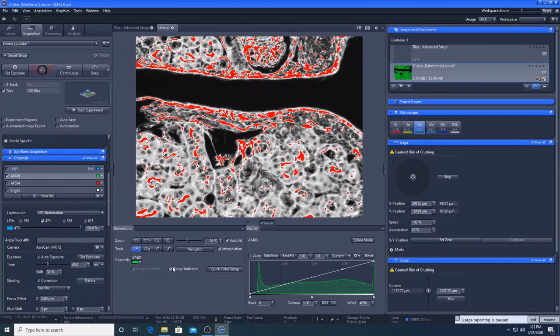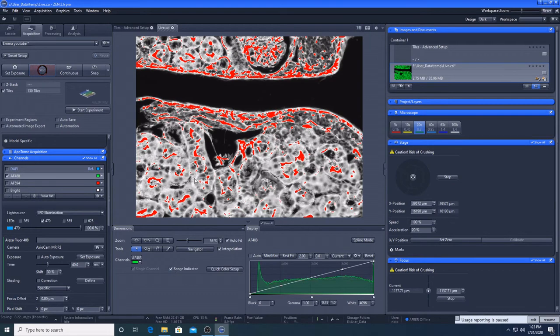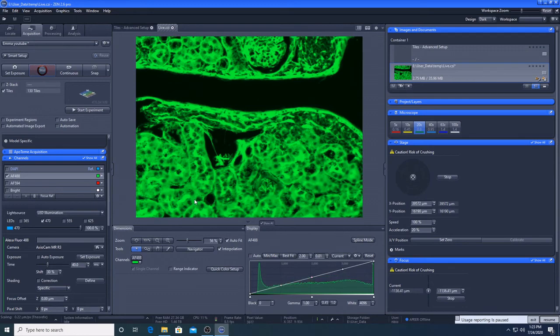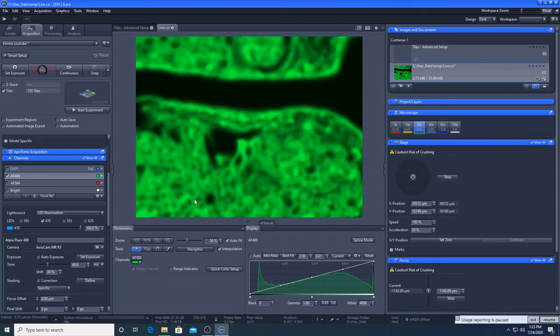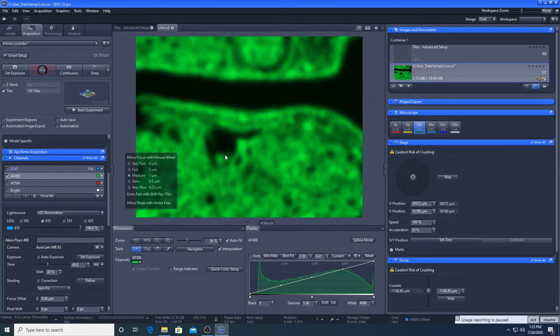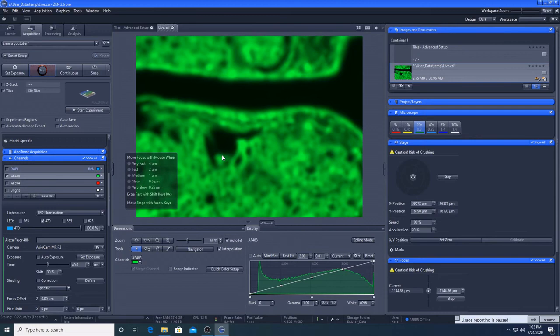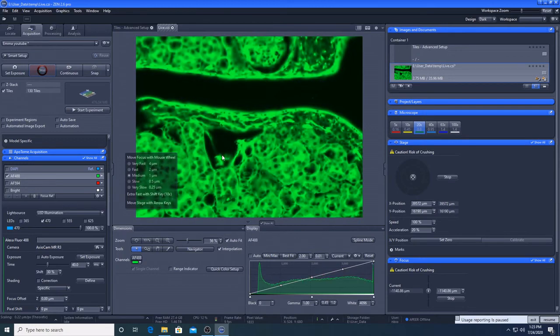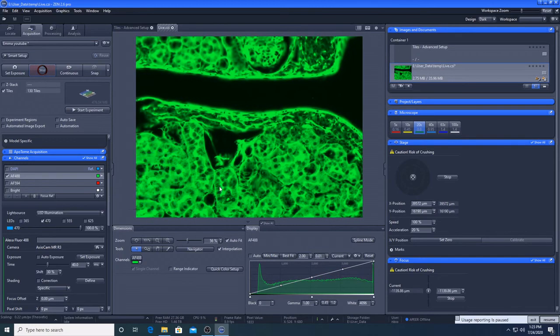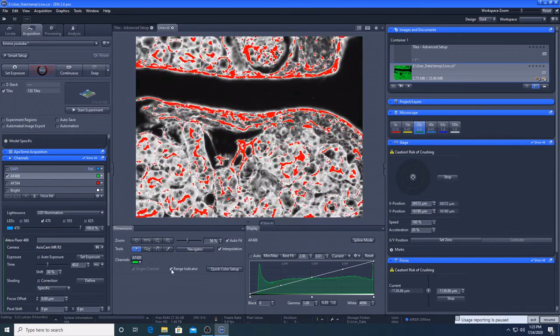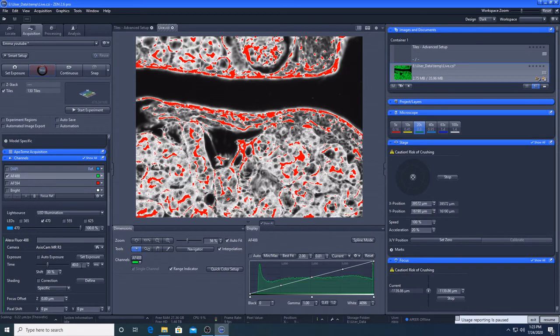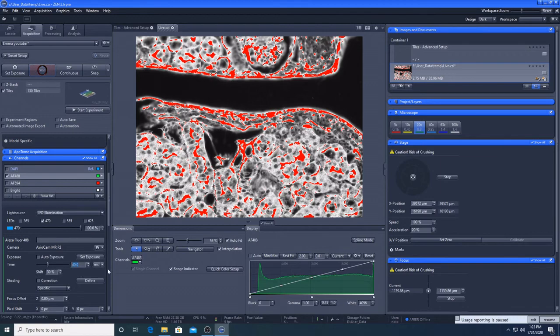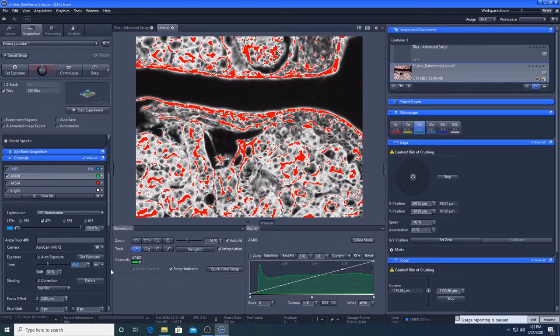If I go range indicator, there, it's overexposed. Use the mouse to get it into focus. Range indicator, massively overexposed. So I'm definitely going to keep my intensity high and lower my exposure. So for tiling, that's a good idea because it will take less time.